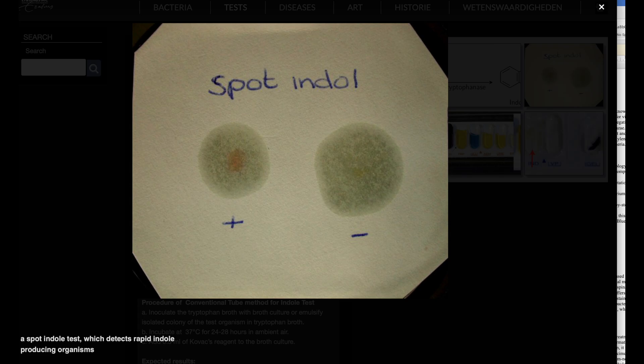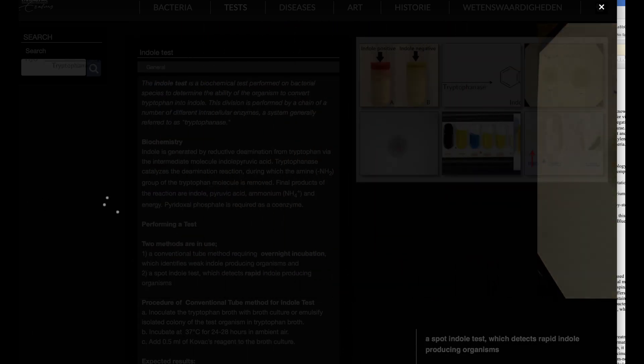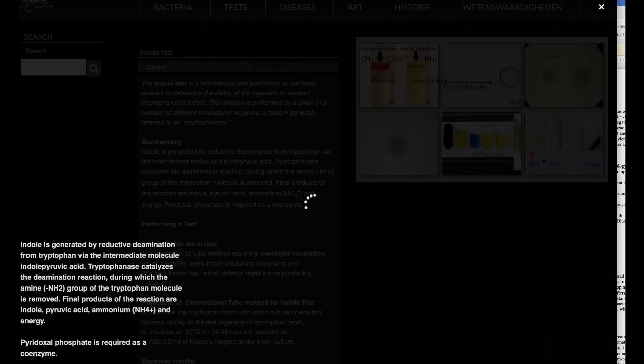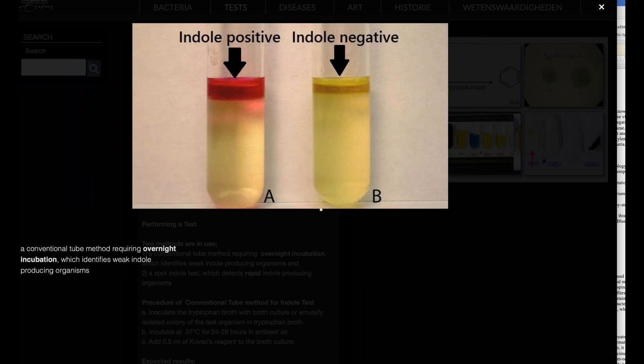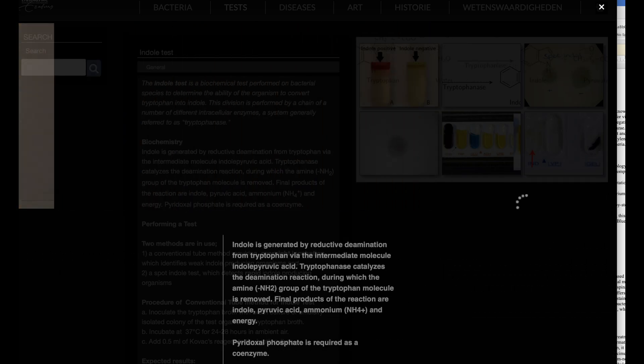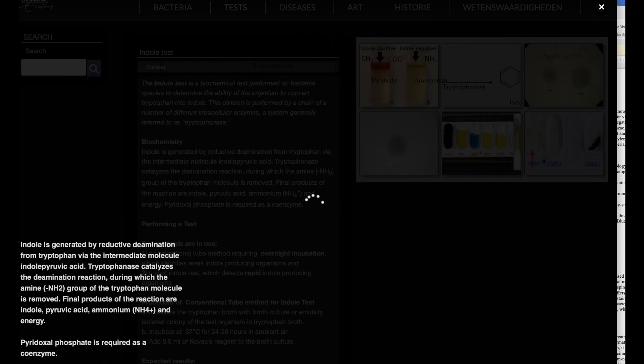Delftia acidovorans and indole. Delftia acidovorans can be identified using a simple orange-indole reaction test. When Kovacs reagent is added, the organism produces anthranilic acid from tryptophan, resulting in a characteristic pumpkin yellow or orange color in the media.